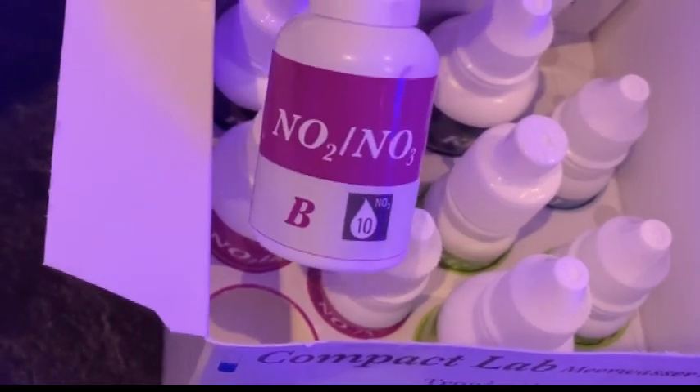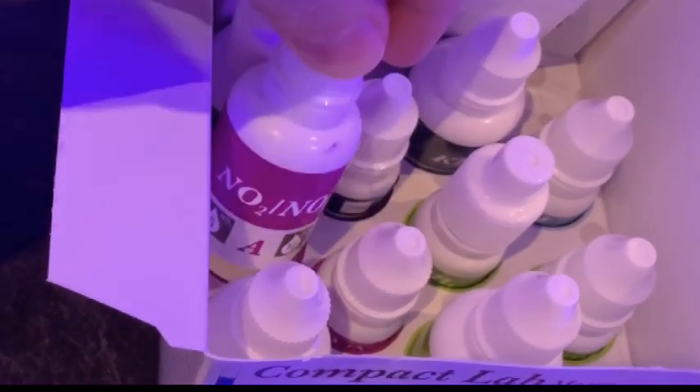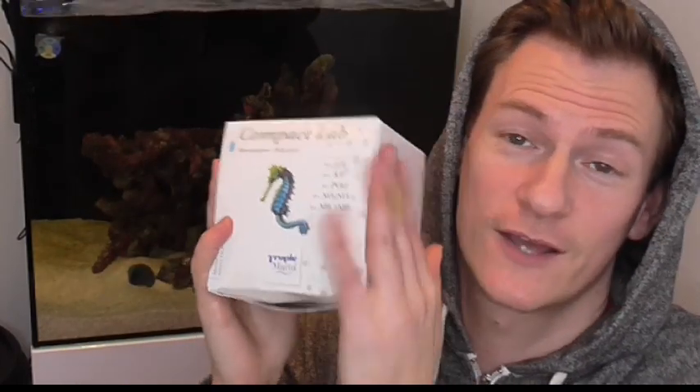What I've done is I've gone with the Tropic Marine Compact Lab, and this is a great little test kit because it actually includes your pH, your KH, your phosphate, your nitrate, your nitrite, and your ammonia test — all in this one little pack. It's a great beginner's starter kit, and today I'm only testing pH, KH, and ammonia.